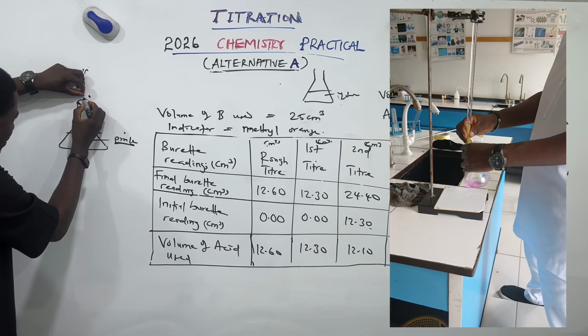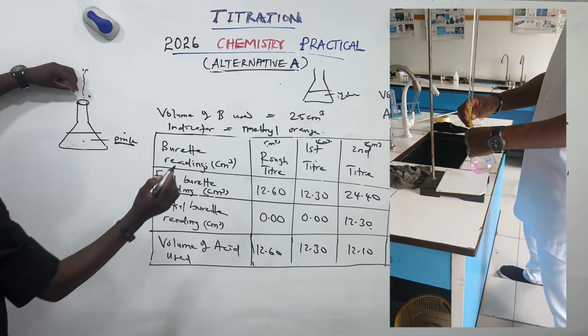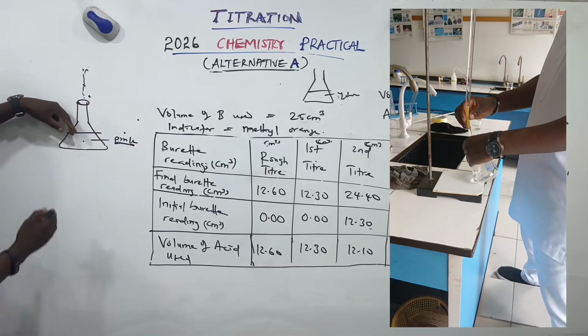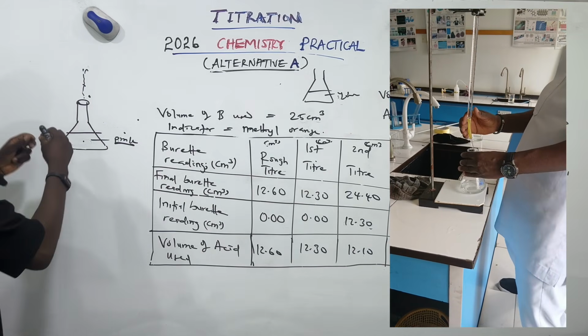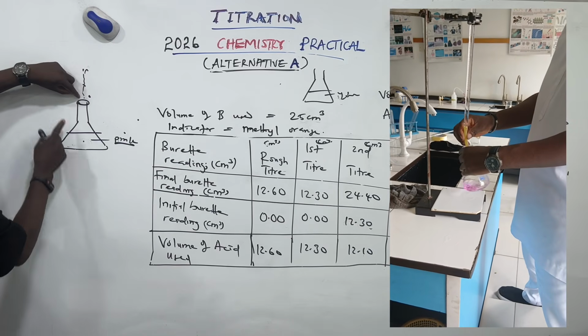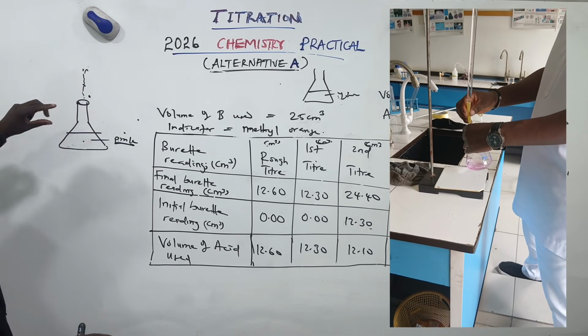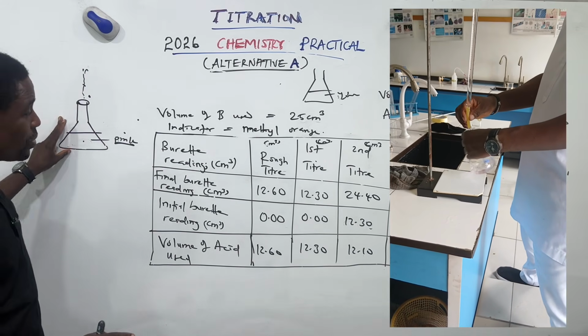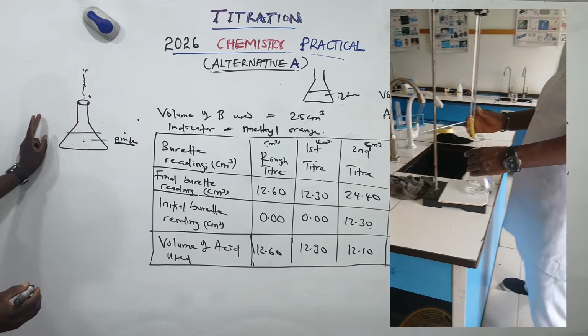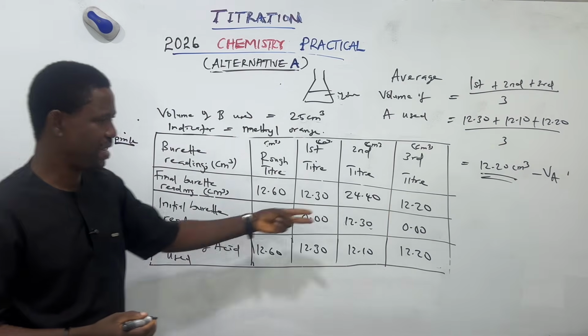So the last drop of the acid turns everything to colorless, because of the color of phenolphthalein in base. So you are titrating to colorless. That colorless means you have dropped one extra drop of acid to turn it colorless. So you have to do this titration as well using phenolphthalein, not just methyl orange. If you use phenolphthalein, you're likely going to get a lower titer value, maybe around 11.8.